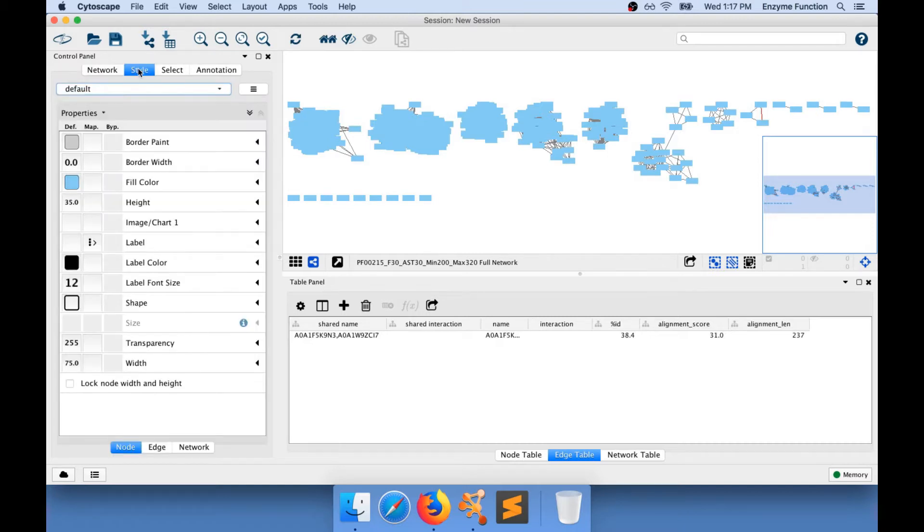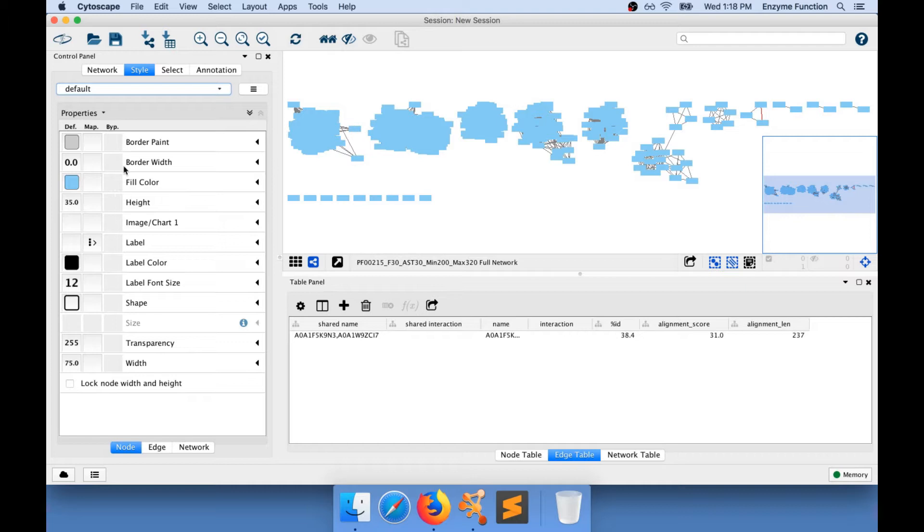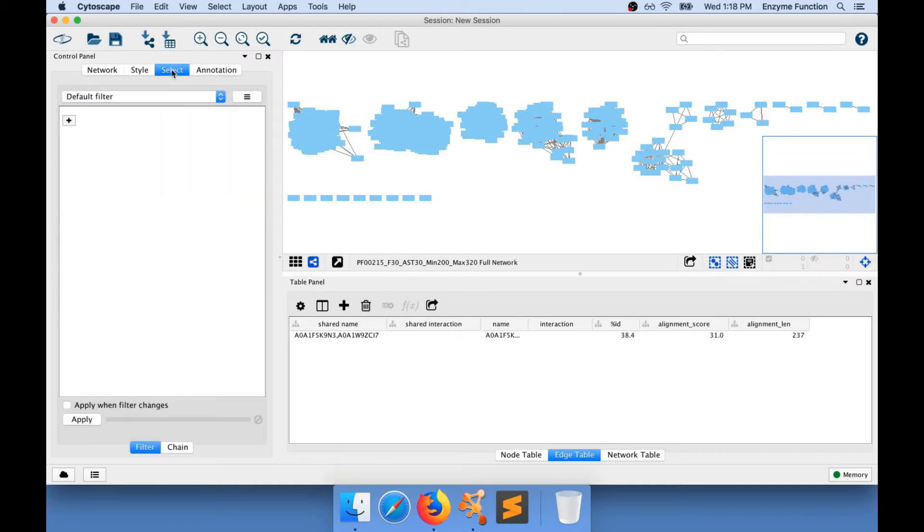We will see in other videos how you can edit the style overall of the network, but also how you can edit the style of specific nodes and edges in the style panel. You can select nodes using filters.